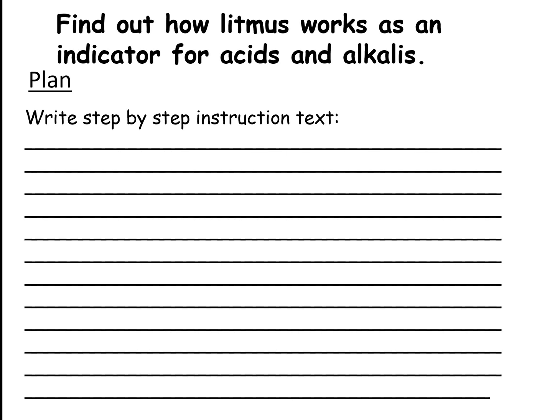So, your first main task for today is you're going to plan an investigation to find out how litmus works as an indicator for acids and alkalis. So I want you to write a step-by-step instruction text, to write your own method. So pause the video and have a go at doing this now, and then I will show you what I came up with.